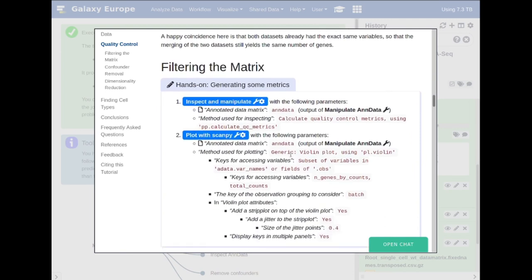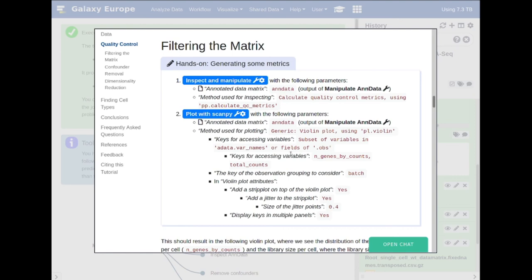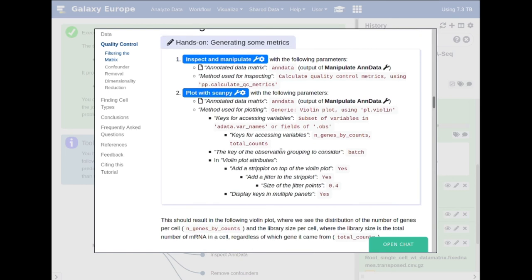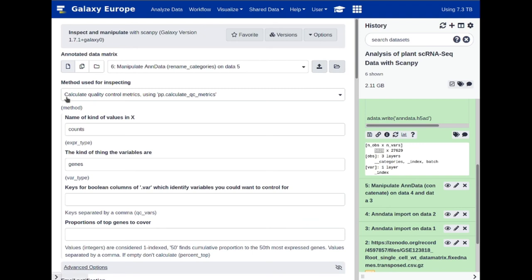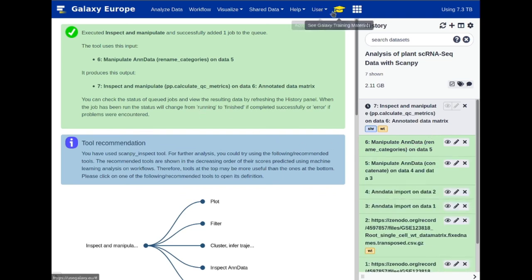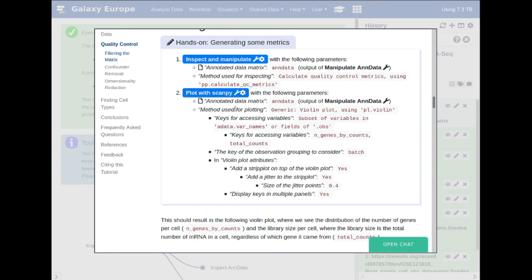What we need to do now — as in the previous tutorial — is to filter and plot the initial QC metrics of the dataset. This gives us a better idea of how we wish to filter the data, and what limits we can impose to reduce noise that may appear later in the clustering. First, click on 'Inspect and Manipulate' and choose 'Calculate Quality Control Metrics', then execute. Following that, we use 'Plot with scampi', making note to copy and paste the keys for accessing variables: 'n_genes_by_counts' (total number of features in a given cell) and 'total_counts' (total number of messenger RNAs in a given cell).